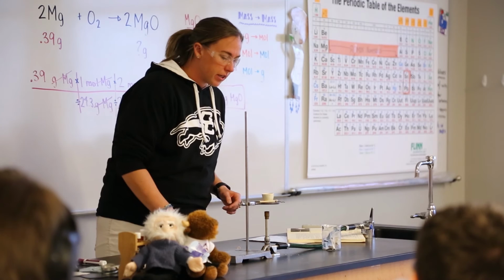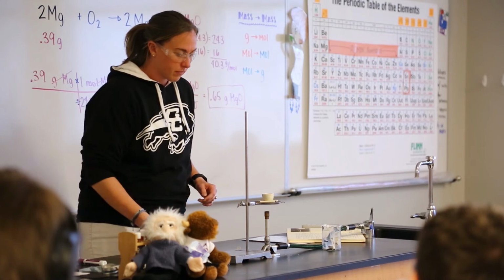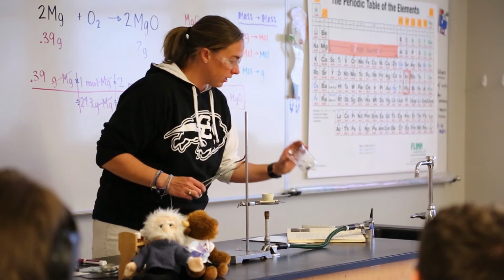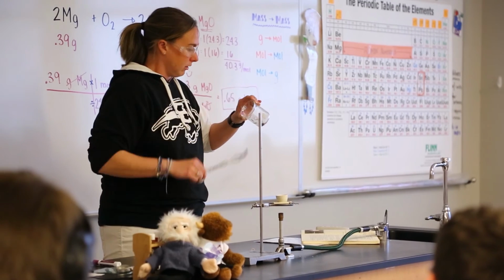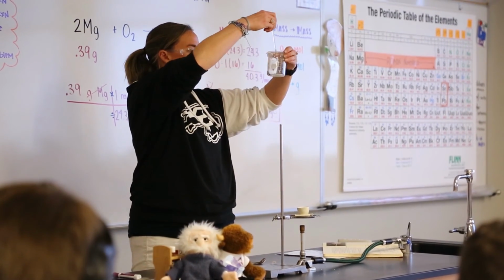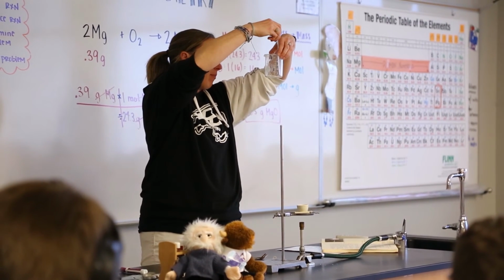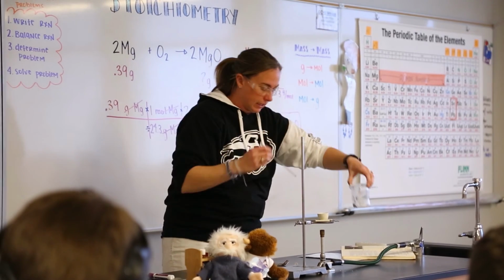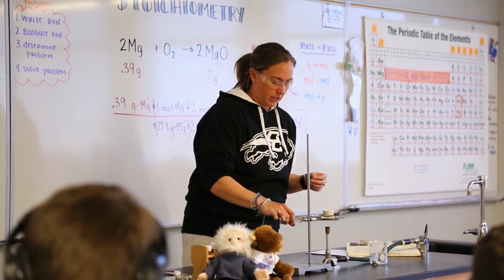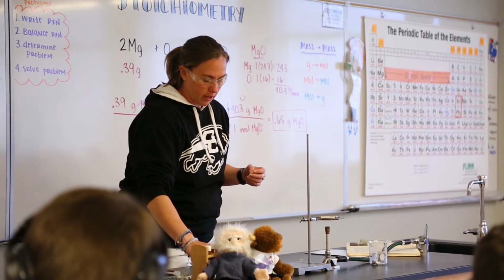Oh, we got a little guy going there. Okay. All right, ready? And it looks just like the white powdery stuff. You guys see that little strip there? But as soon as I touch it, it crumbles up. It's just like an ashy white powder. I'll dump it out here in a second after we weigh it so you can see what it looks like.